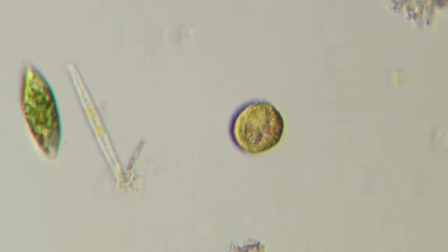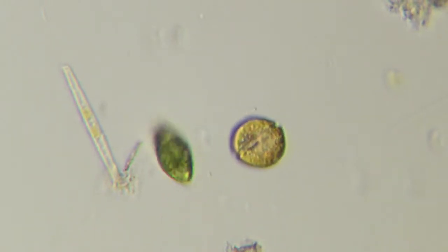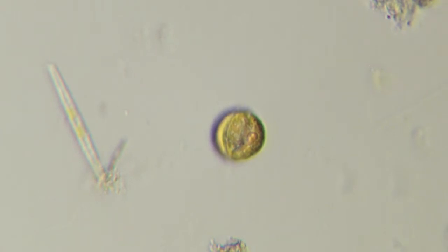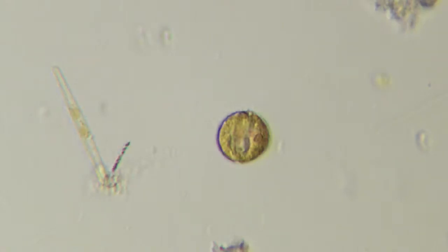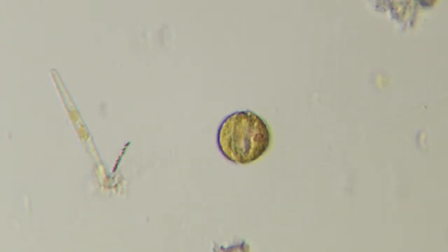And they're really cool, though, because they have this different color, a golden green-yellow color. And see that little channel right there, a little waist with a flagellum going around it? That is a dinoflagellate. I've only gotten one on the show before. That was when I collected at Sausalito or Tiburon, one of those, right next to each other on the bay, in a water sample I had. But this is cool to find one at the Baylands.